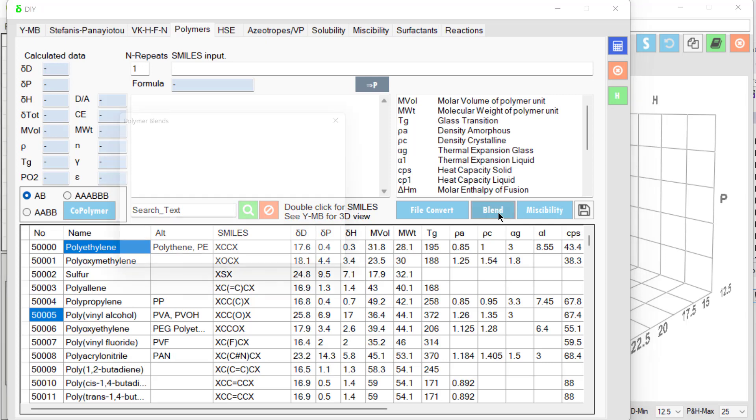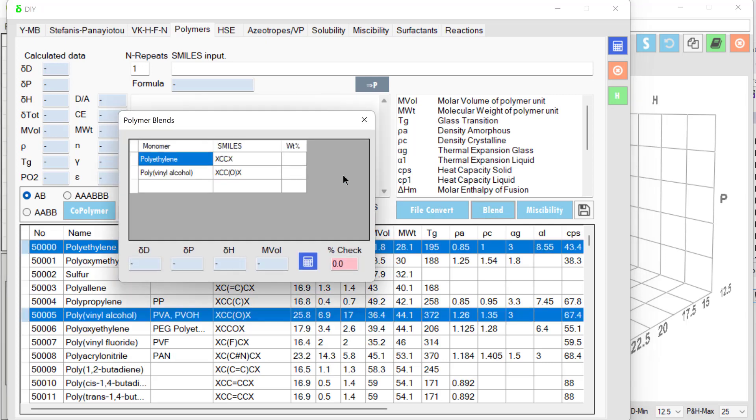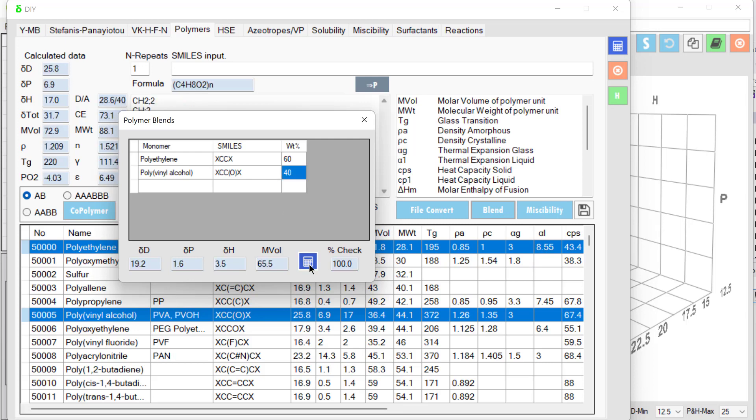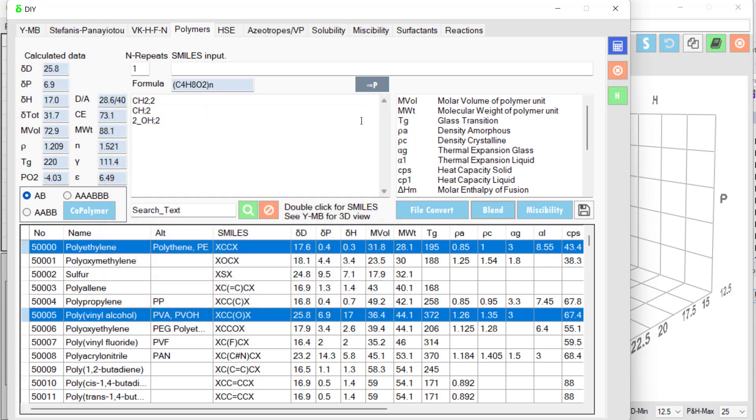We call the blend. And let's say we want 60, 40, PE, PVOH. We calculate it. And there we have the estimated HSP of this particular EVOH. So the polymers are very powerful.